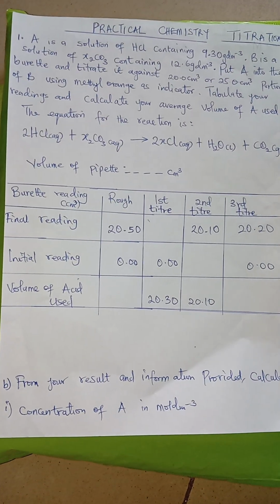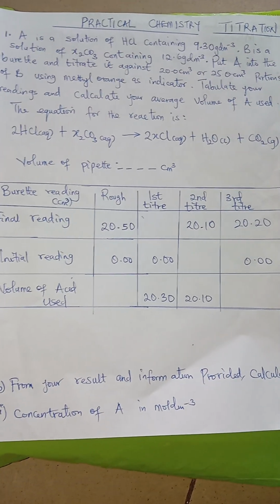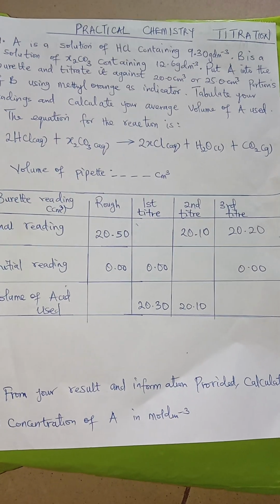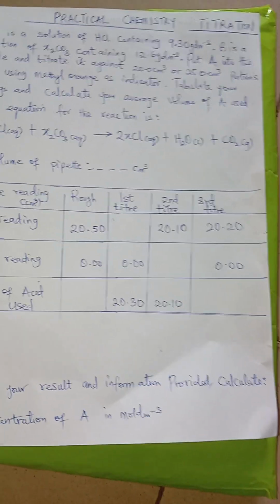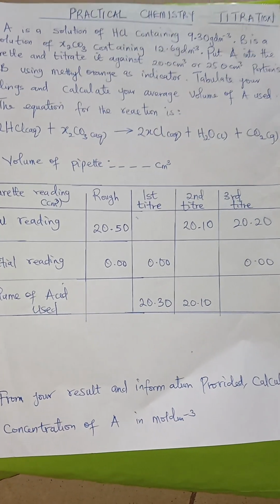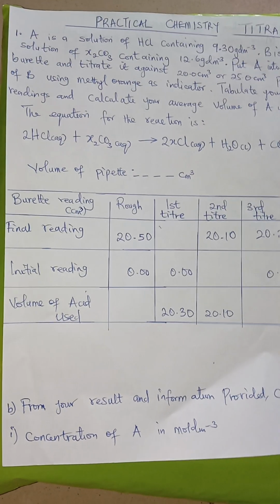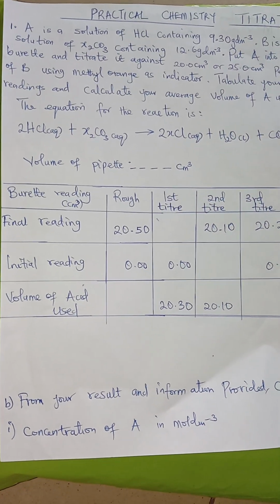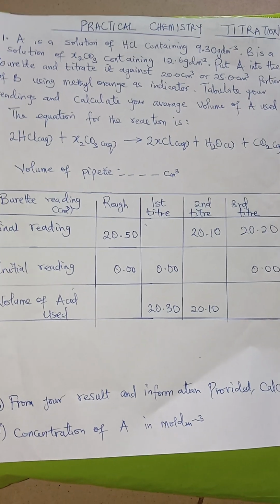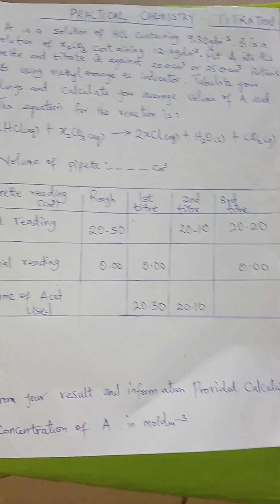And remember, in my last video, I promised I'd be making a video on practical chemistry. As WAEC is approaching, students are really finding it difficult to go about practical questions. And here I've come up with something interesting, something that you'd like. This practical is on titration.